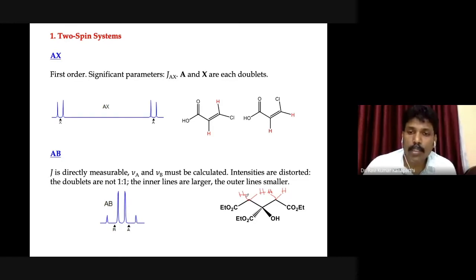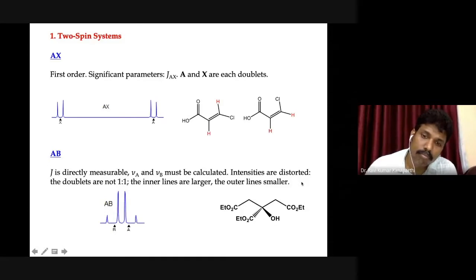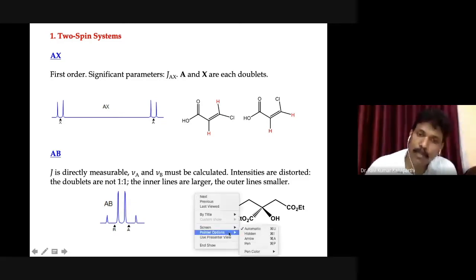So I think let me verify this. I'm not sure whether I copied the right example or not, but to answer your question, probably this is the reason, or these ethyl protons. I have to check basically. So here there is an ethyl group. So these AB protons are in this ethyl group, or a different one. Let me verify. What you raised is a good point.